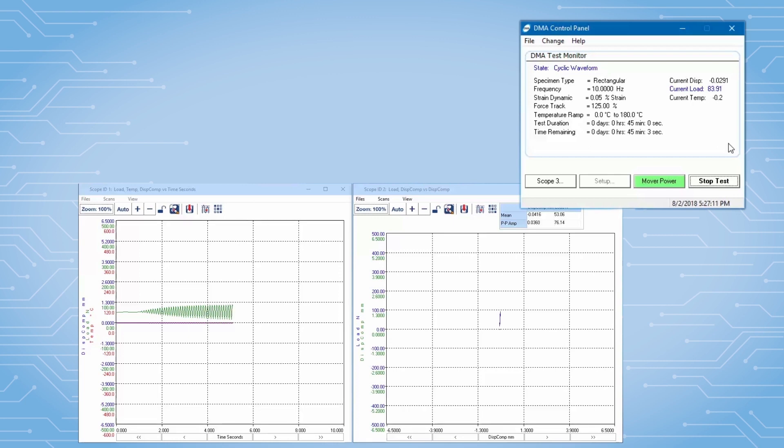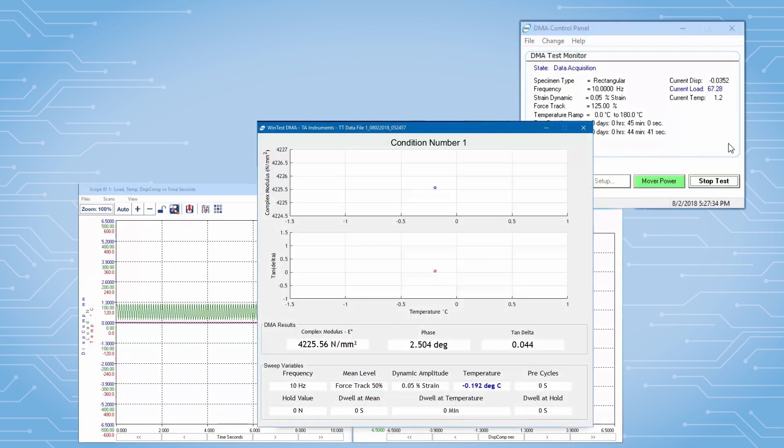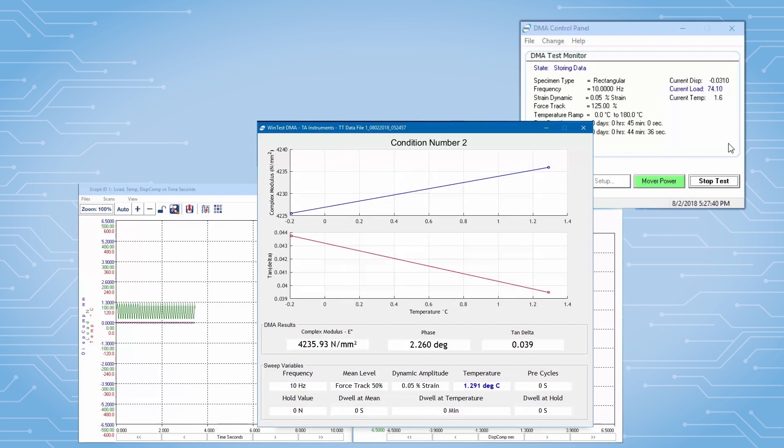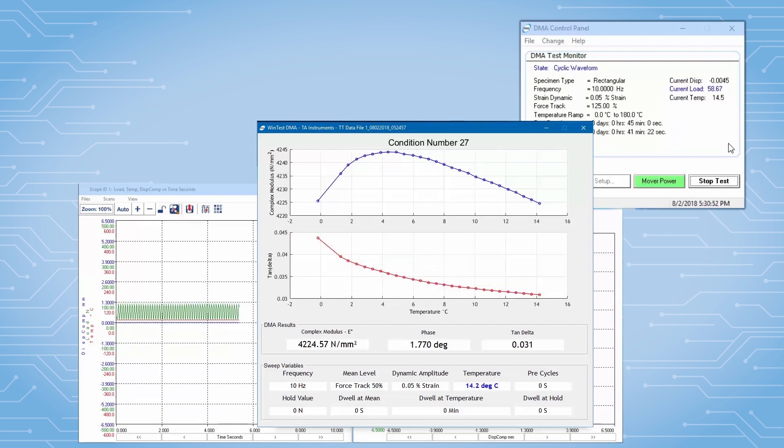After the first condition, a real-time results window displays the results from the first point. This updates with each new data point until the test is complete.